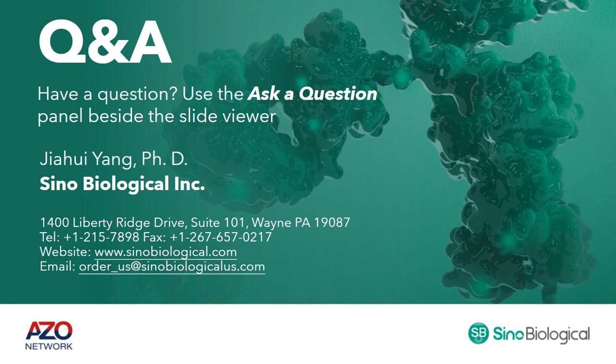Here's a good question. Can you explain how to obtain positive clones with diversified sequences from phage display? First, we will construct a library with a size of 10 to the 8 to 10 to the 9. If sequence diversity is crucial in your further experiments, we suggest you include a test to determine sequence diversity of the library, such as NGS. We don't usually include this step.